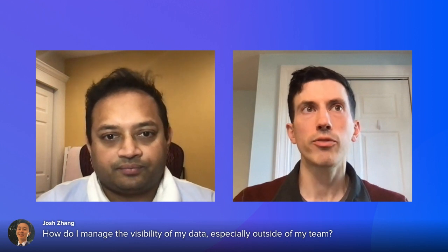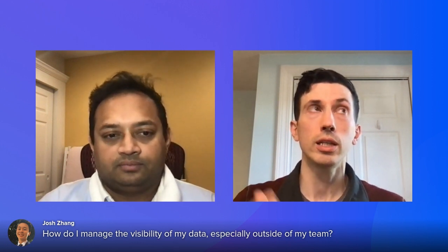Yeah. So there's a couple different ways. I touched a little bit on managing visibility and accessibility through permissioning structures on the projects themselves. So a project can be defined as however you delineate your work within your company, either at the team level or maybe campaigns or things of that nature. So you can provide access to those.